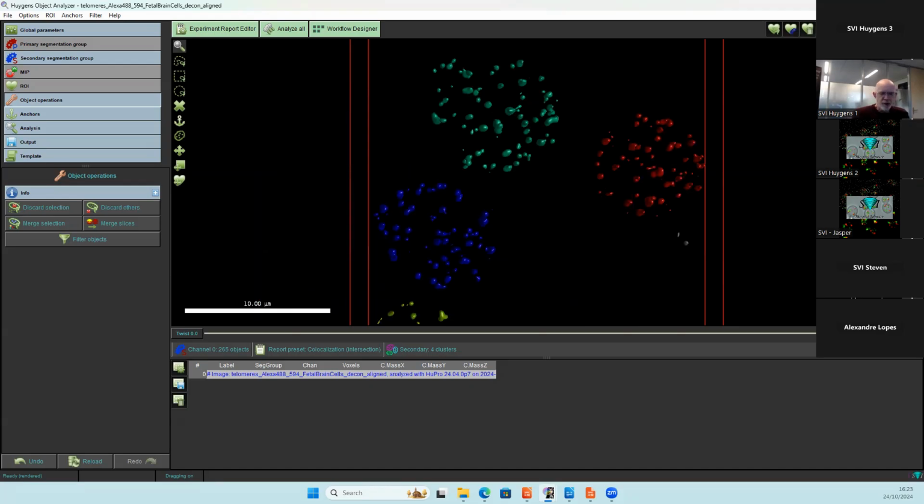Now we want to measure the volume of the clusters. This can be done with a convex hull wrap approach. This is a known method in which you can consider that we wrap the cluster in plastic foil. We tightly wrap it around the cluster, and we can then measure the enclosed volume for analysis. This approach can be, for example, used if a nucleus staining is very irregular.